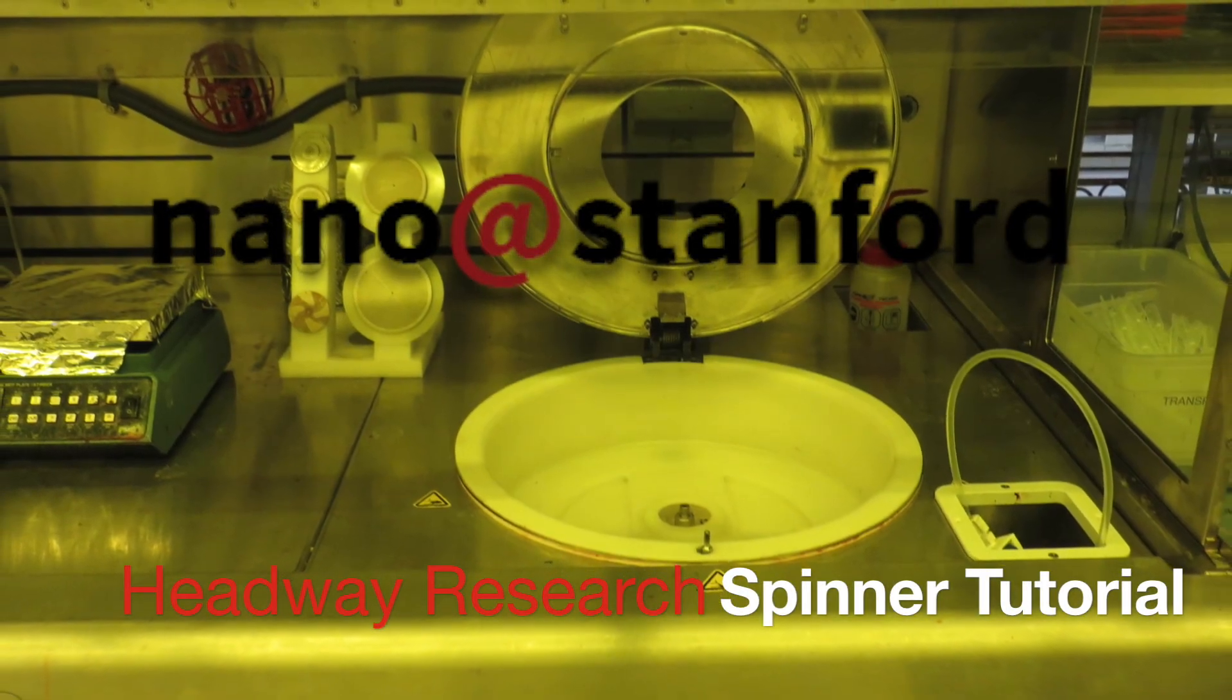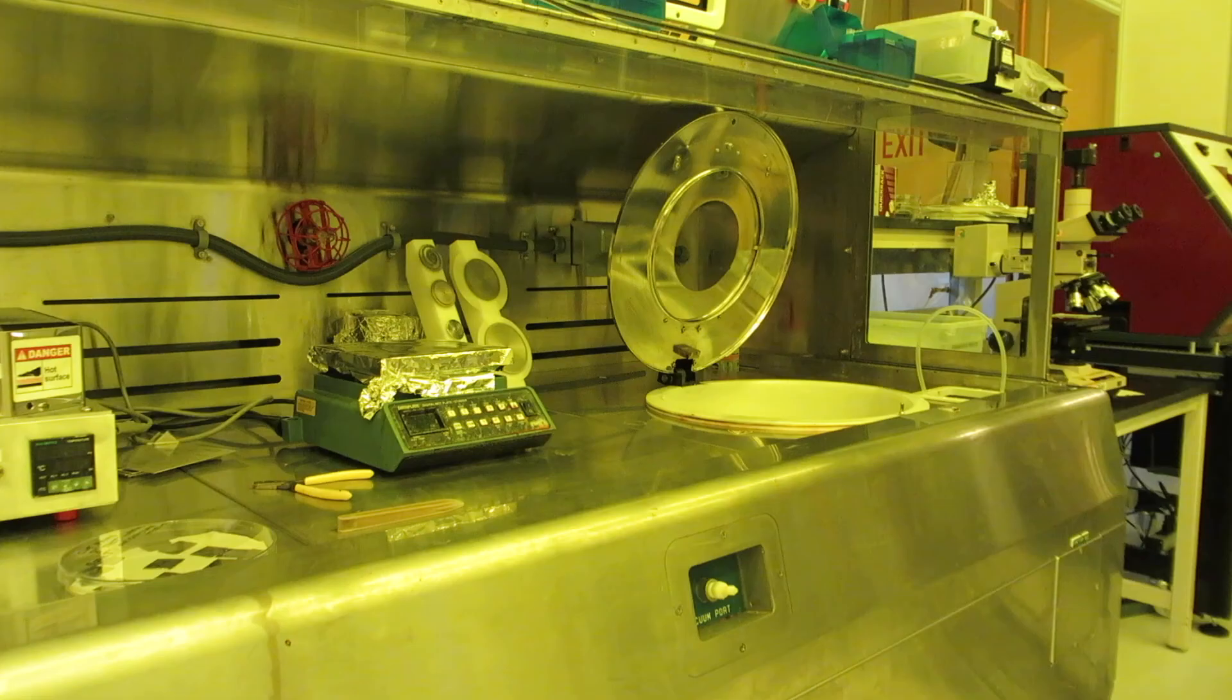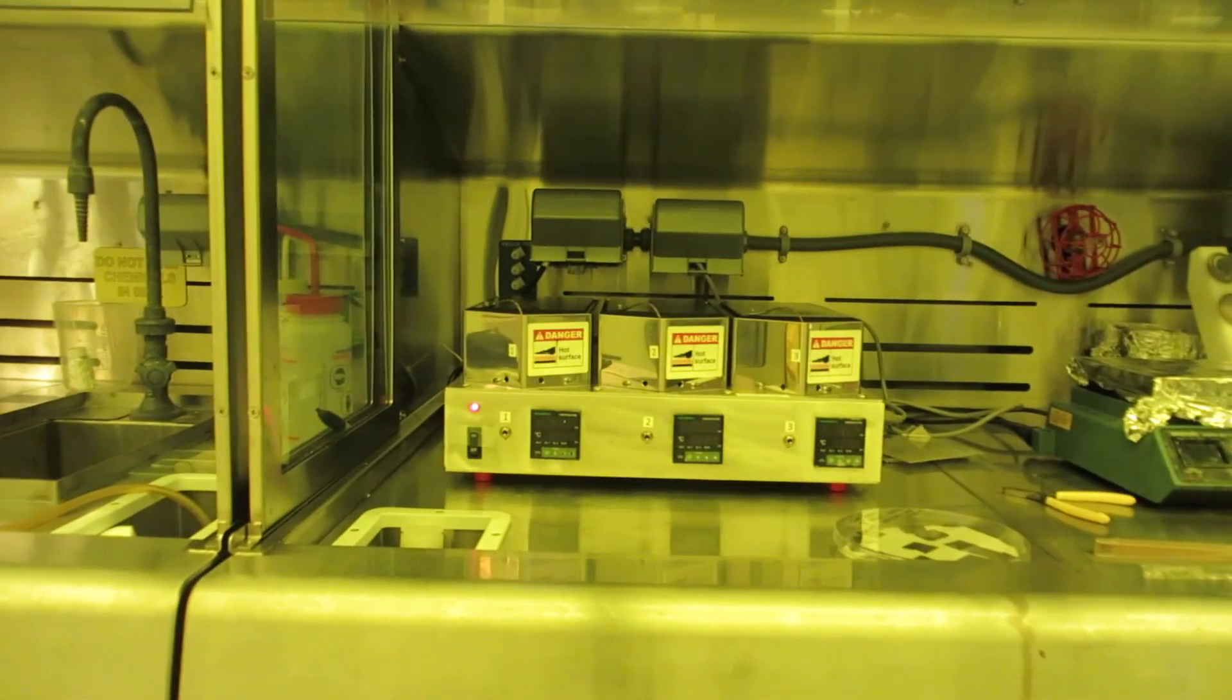This is a tutorial on using the Headway Research spinner in the flexible clean room. Before you start setting up the spinner, it's a good idea to go over to the hot plate and turn it on so that it'll have time to stabilize by the time you're ready to use it.